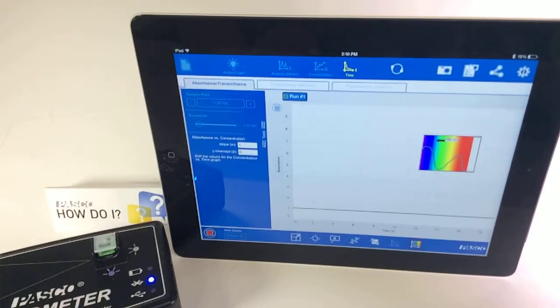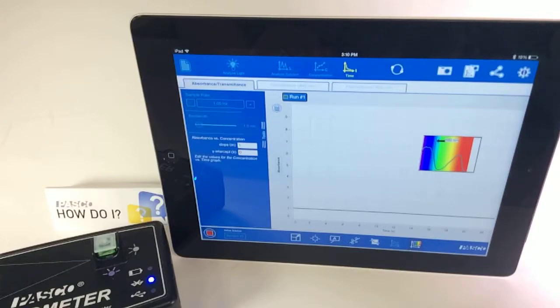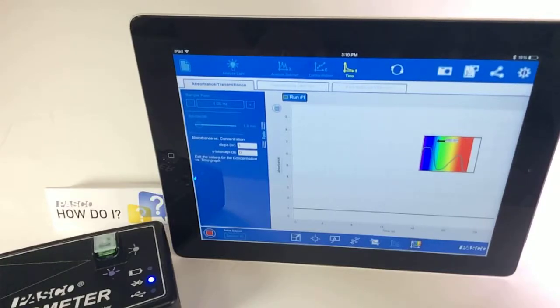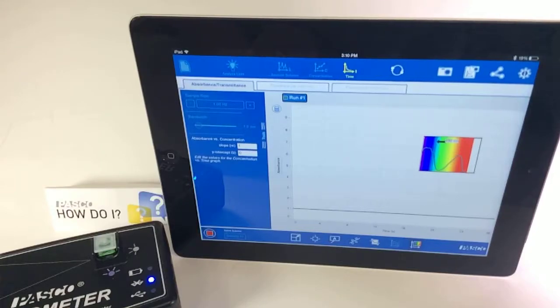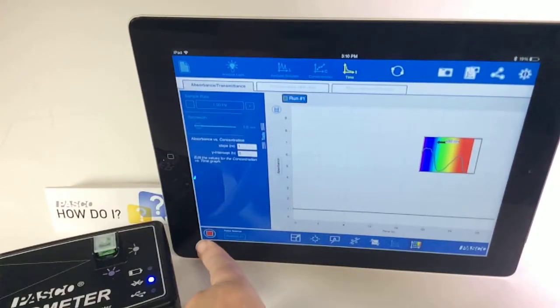such as a blue colored solution that then you added bleach to, you could investigate the kinetics of that reaction by looking at the rate of change in the absorbance or transmittance over time.